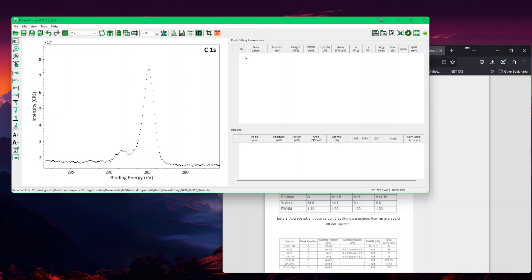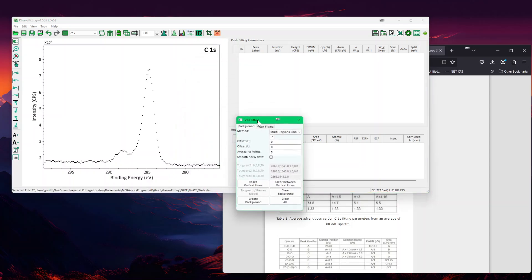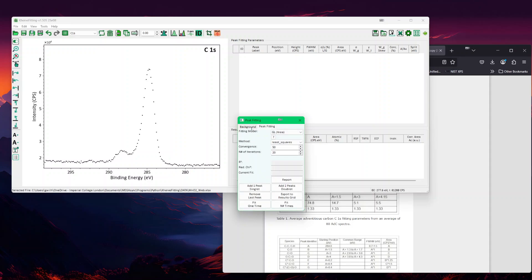Let's go into the peak fitting. For that, we are going to use the peak fitting screen here. We would first use the background.